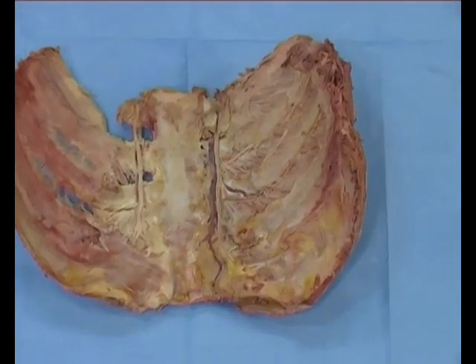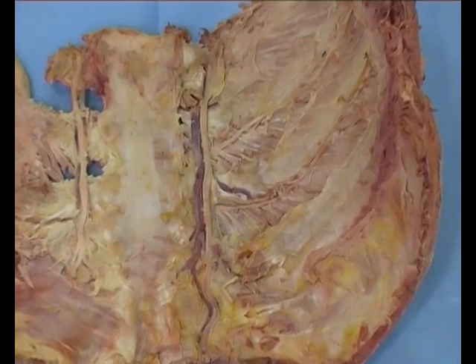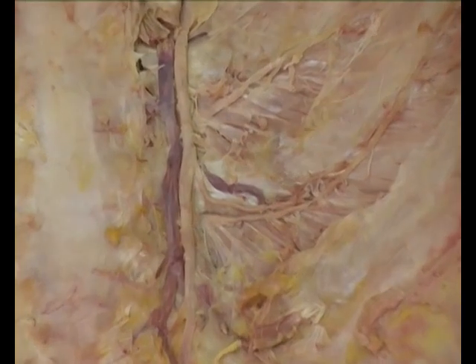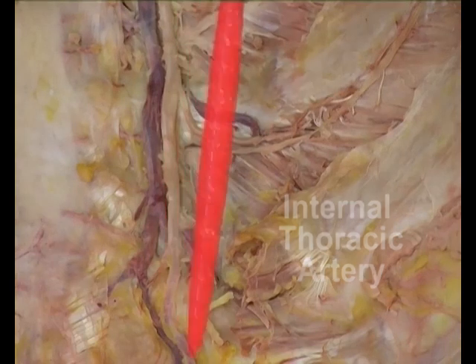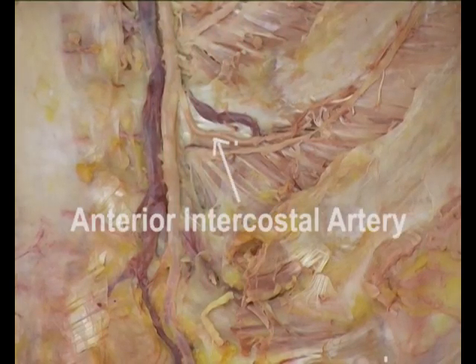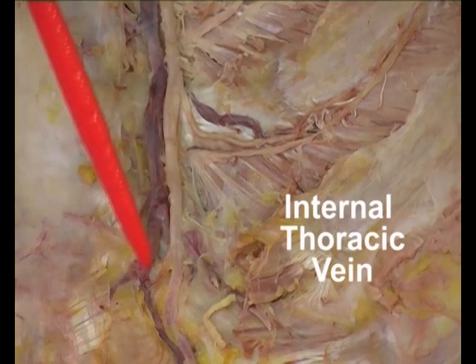Dissect out the internal thoracic artery and vein and follow their course. Identify the following: the internal thoracic artery. Also identify the anterior intercostal artery, which is a branch of the internal thoracic artery. Identify the internal thoracic vein.